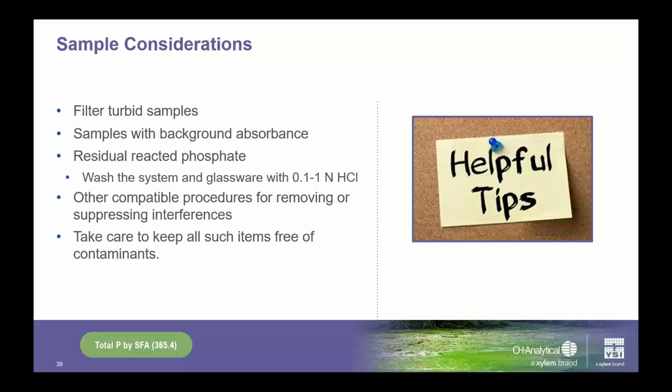You had asked whether an N to P ratio would be the way to do that. That is not what I would recommend for looking at the biofouling on a membrane, because the N to P ratio isn't really telling you what the biomass is that is there. N to P is more of a water quality measurement to tell you what your risk is of developing a harmful algal bloom. But if you want to look at biofouling on an RO membrane, I would scrape a sample off of that membrane and I would do a chlorophyll extraction on it. So that's a really great question, and thank you for asking that.